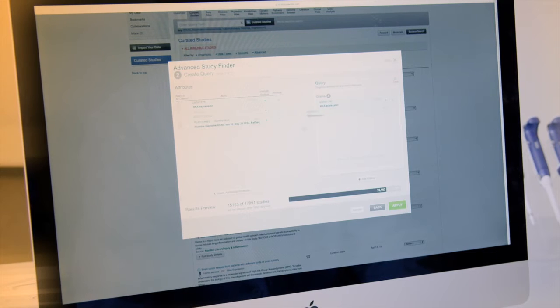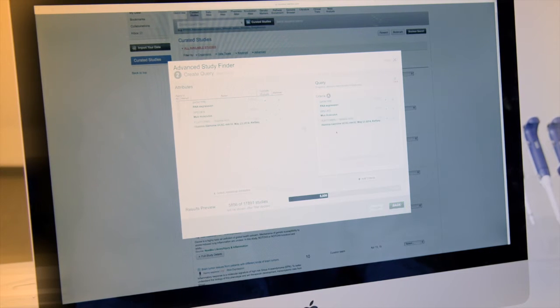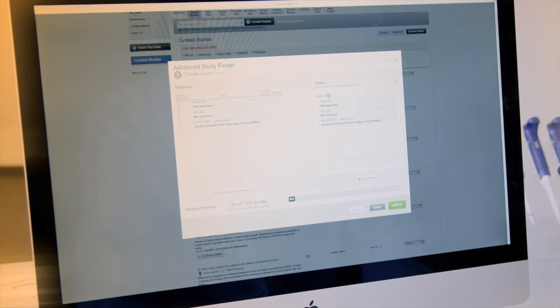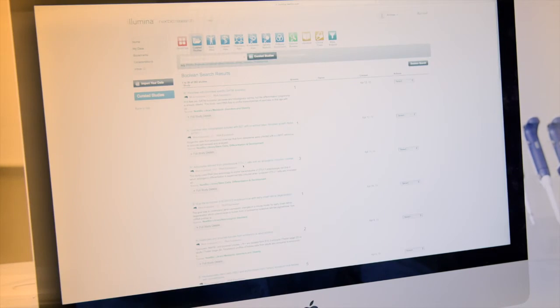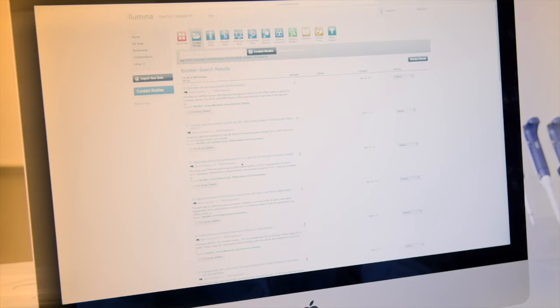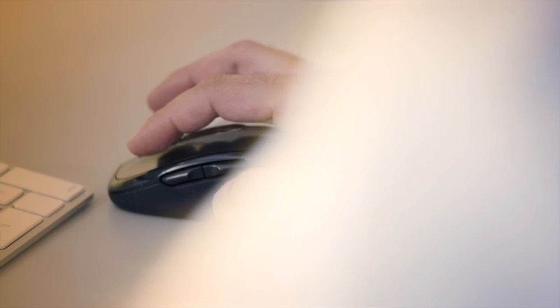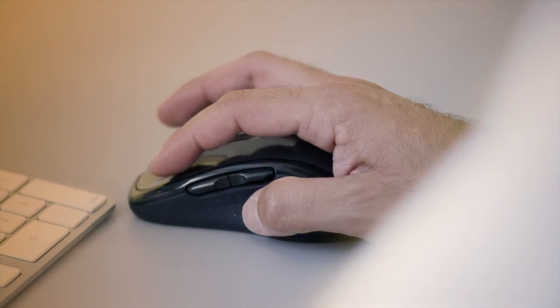Access content from GEO, ArrayExpress, and many other public data sources automatically, all at the touch of a button.